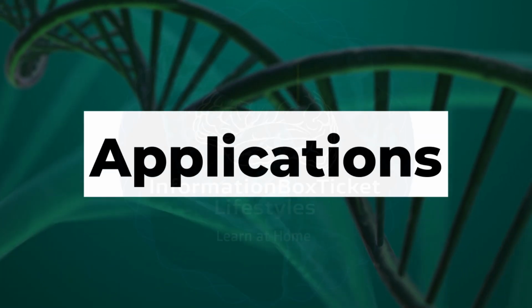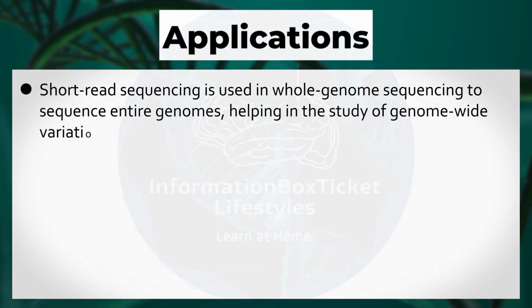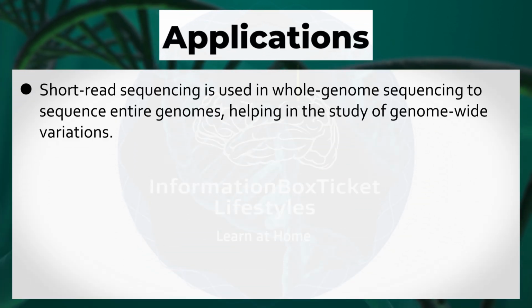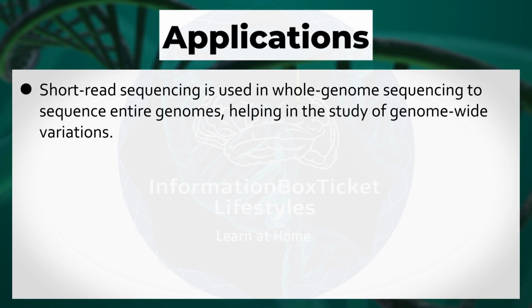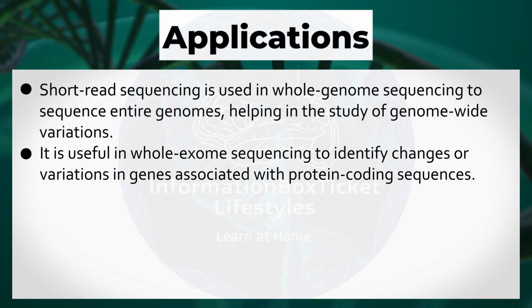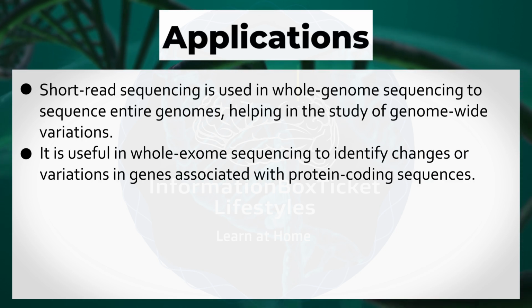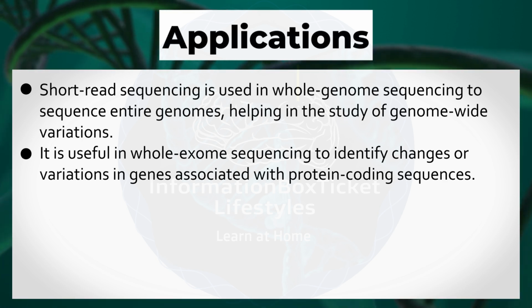Applications of short-read sequencing. Short-read sequencing is used in whole genome sequencing to sequence entire genomes, helping in the study of genome-wide variations. It is useful in whole exome sequencing to identify changes or variations in genes associated with protein coding sequences.